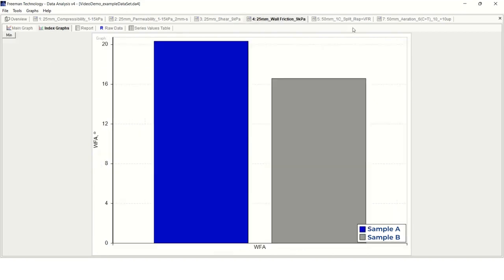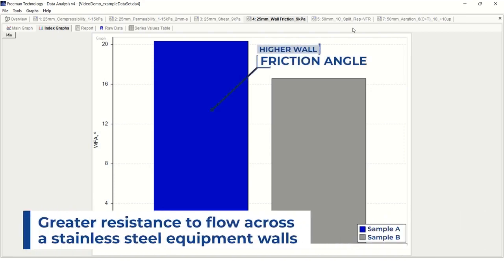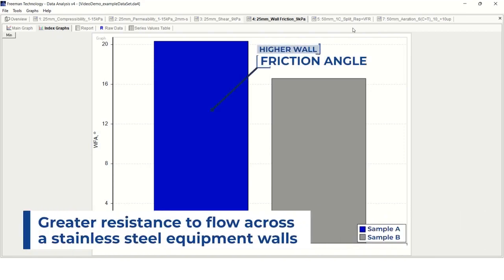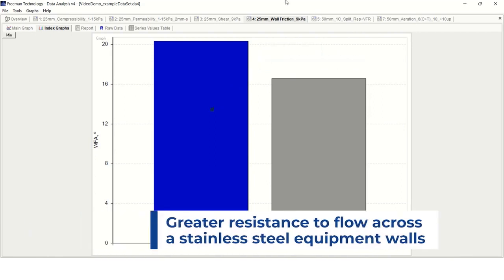Lastly, we can look at a wall friction test where we are characterizing the two different batches in terms of their ability to flow along a stainless steel disc. The main parameter that comes from this test is a sample's wall friction angle. Here, sample A generated a higher wall friction angle, suggesting that it has greater resistance to flow across the stainless steel equipment walls.